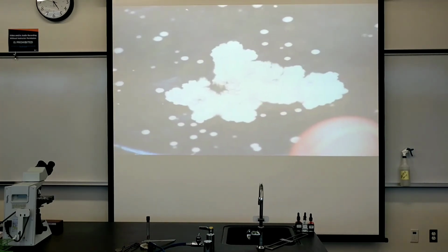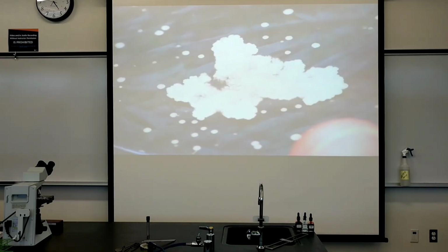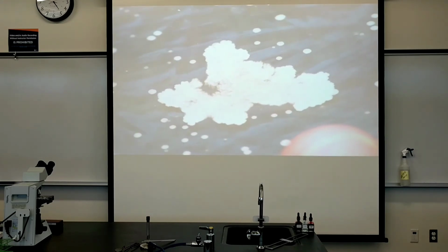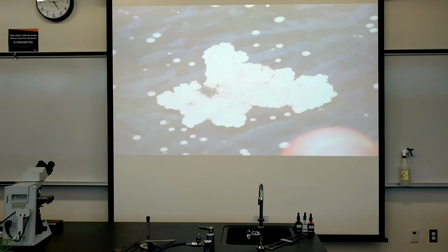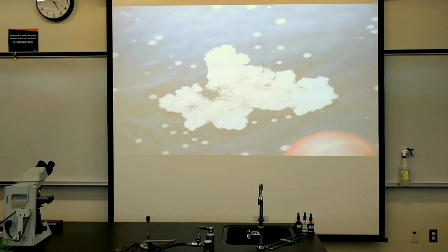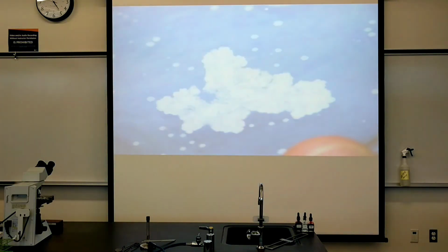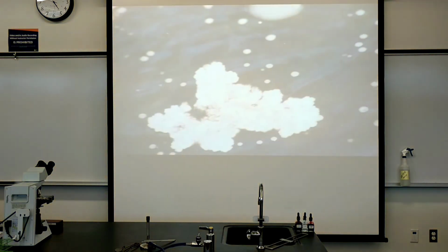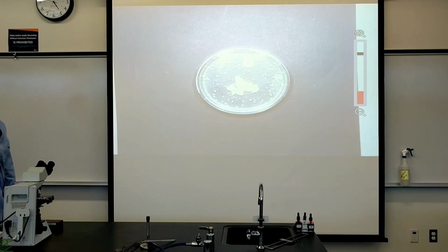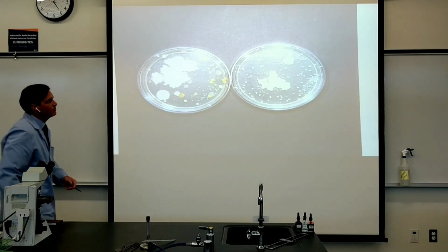I was talking about this before, that this colony, as irregular as it looks, does not appear to be bacillus. It's a little too erose or unusual and irregular, and it is waxy looking. And although it doesn't look like a velvety or fuzzy appearance, the waxy appearance of it is typical of something called trichoderma, and you don't have to memorize that, but again, a sample would tell us the story microscopically. Well, that's too bad we didn't have any fungi that were fuzzy to look at, but those were our two plates.